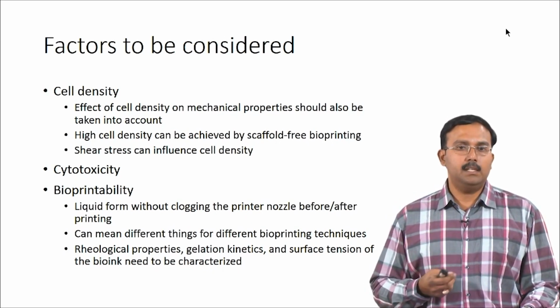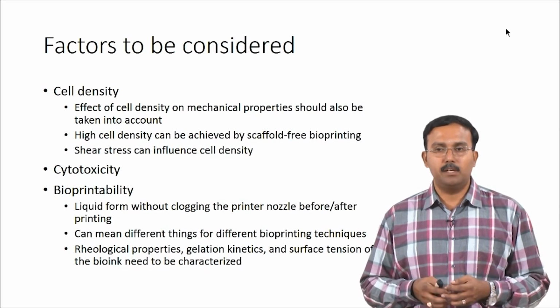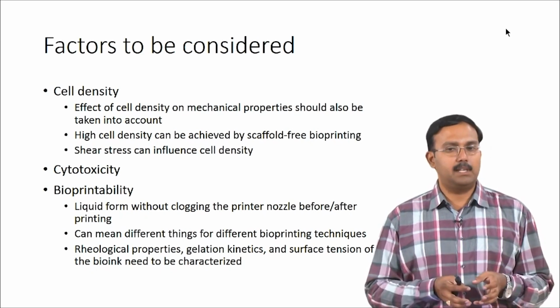Another thing is that printability itself can mean different things for the different techniques which are being used. We will talk about the techniques, and while we do, we will talk about what exactly would be printability for that specific technique.